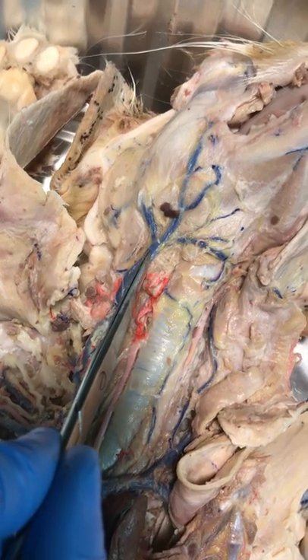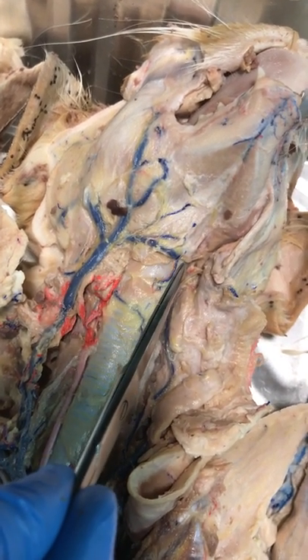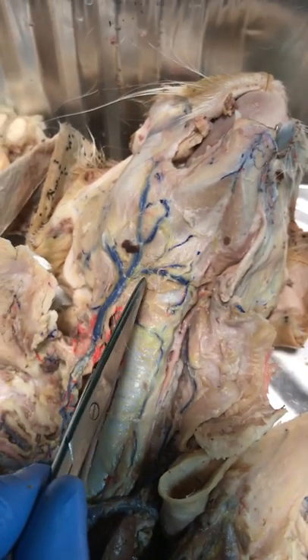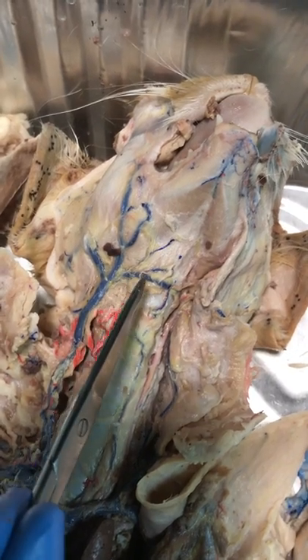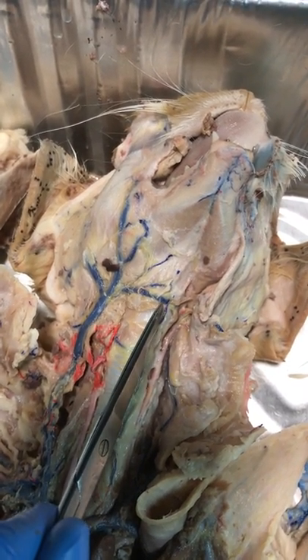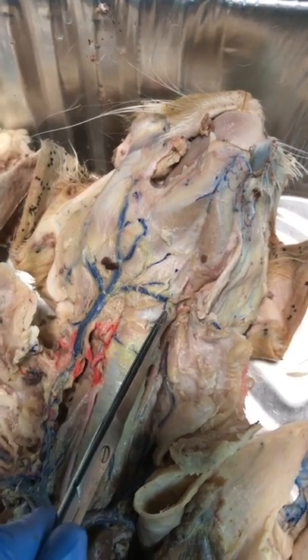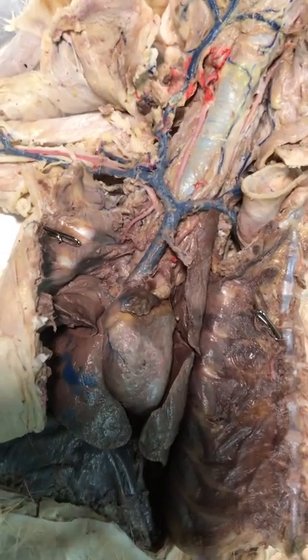There is a bridge across to the other jugular. You can tell it's the trachea because it's hard. The bridge across the trachea is called the transverse jugular vein.